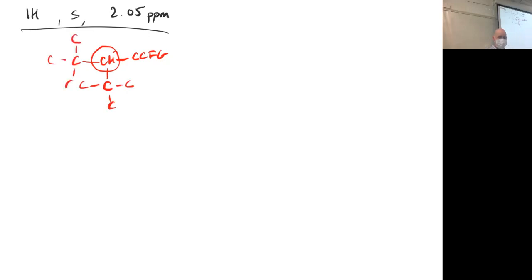Does this look likely? It's theoretically possible, but it's a super weird situation. However, a 1H singlet is pretty common. A 1H singlet is probably not this. A 1H singlet is probably this. Or this. So when you see a 1H singlet, you will probably be able to figure out a situation in which you can make that work. But it's probably not going to line up with the rest of your molecule, because this is a really rare, weird fringe case.